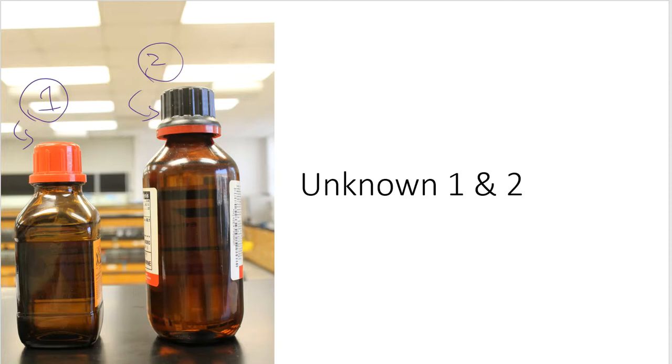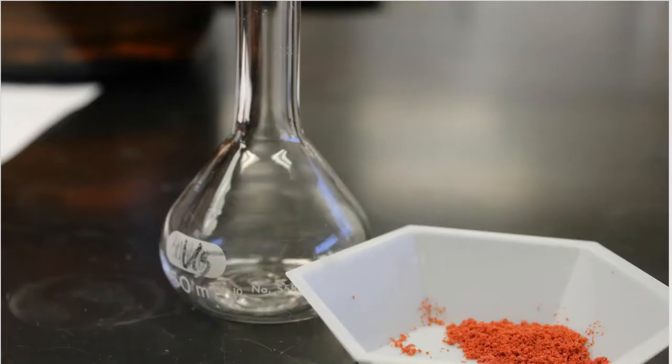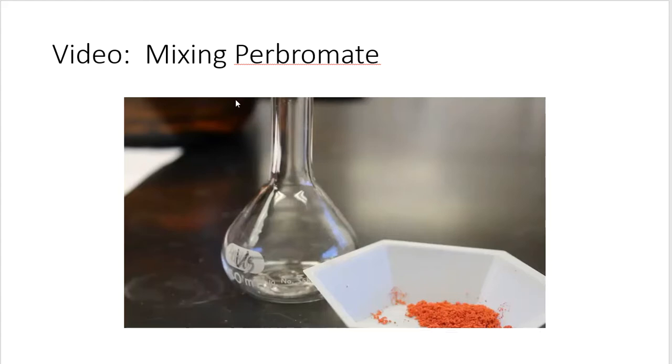All right, so I've got all of my solutions together, and all of my solutions have to be tested. And they don't need to be tested once. They're actually going to have to be tested twice. Oh, gosh. So that means I need 2 sets of test tubes, but we'll get there when we get there. All right, so now I'm going to go back to my solution of PBP. I haven't made it yet. So you can see in the picture, there is my PBP. I'm getting ready to add it to the volumetric flask. So why don't we do it together, live? Not live, but pre-recorded.